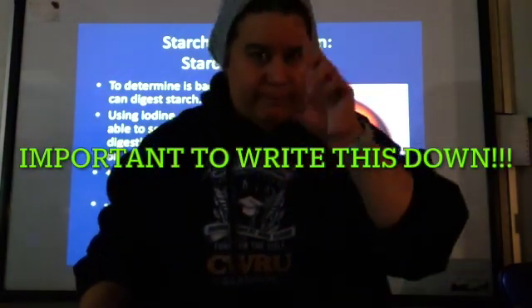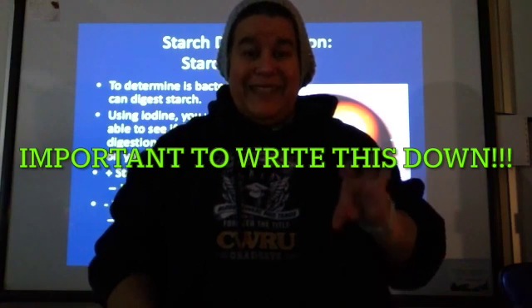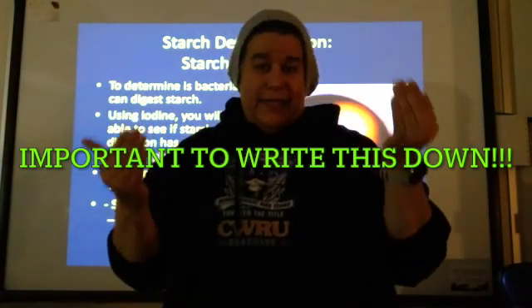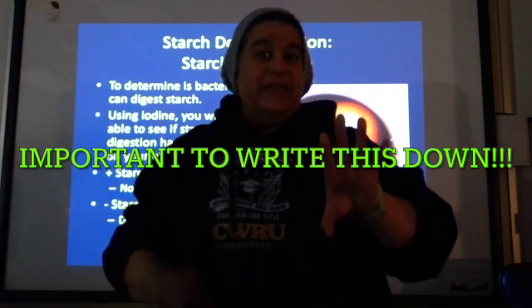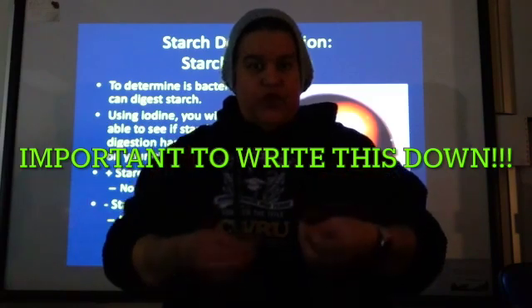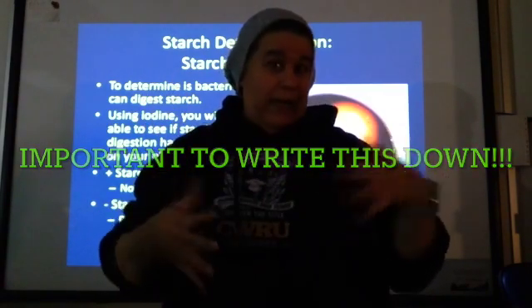Now, I want you to note something. In your lab manual, there is a typo. It says that it turns black when it has starch digestion and turns black when it doesn't. That is not right. Starch digestion happens, it's brown. No starch digestion, black. Literally, you can get starch and cornstarch and put iodine on it and it's black.